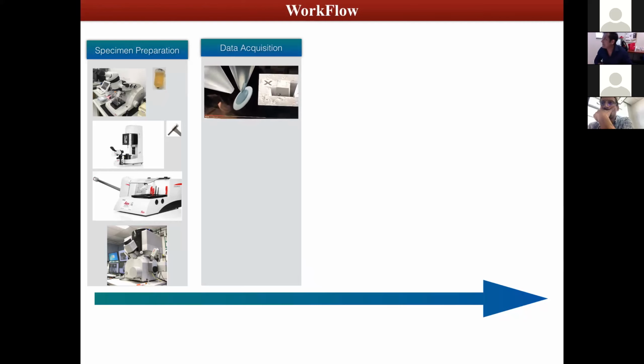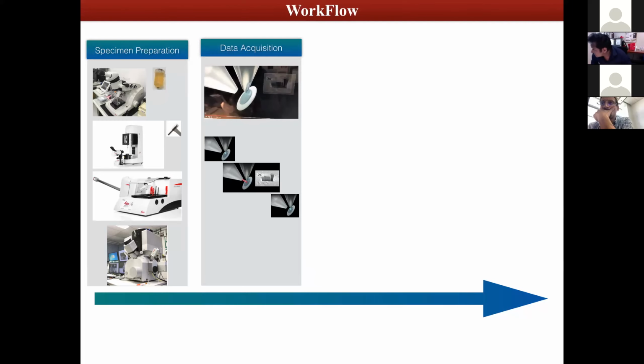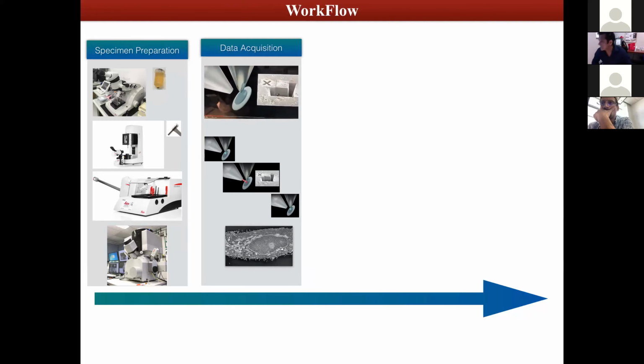So you have a very thick sample that you cannot study in a TEM because it has a limitation of maximum thickness of 100 nanometers. You can go to a couple of millimeters here using this instrument. So you will be able to form the whole electron density map of that particular region, ranging to quite an extent. This is what the snapshots will look like. And then what you are going to get is a stack of data.